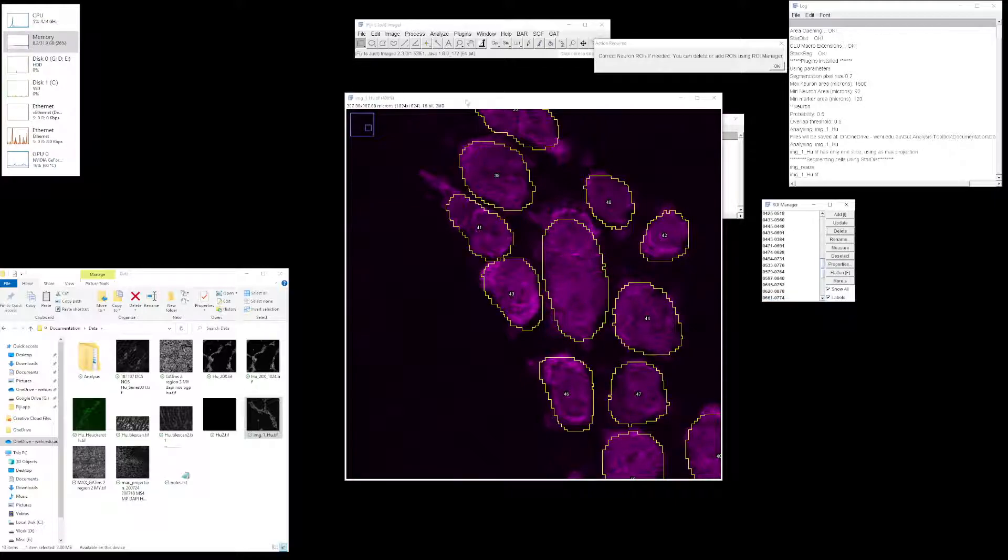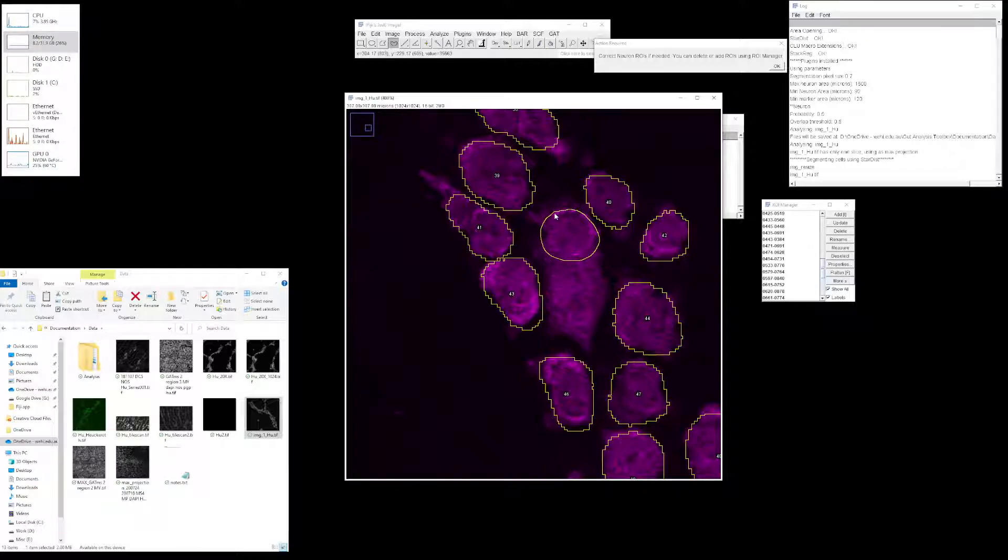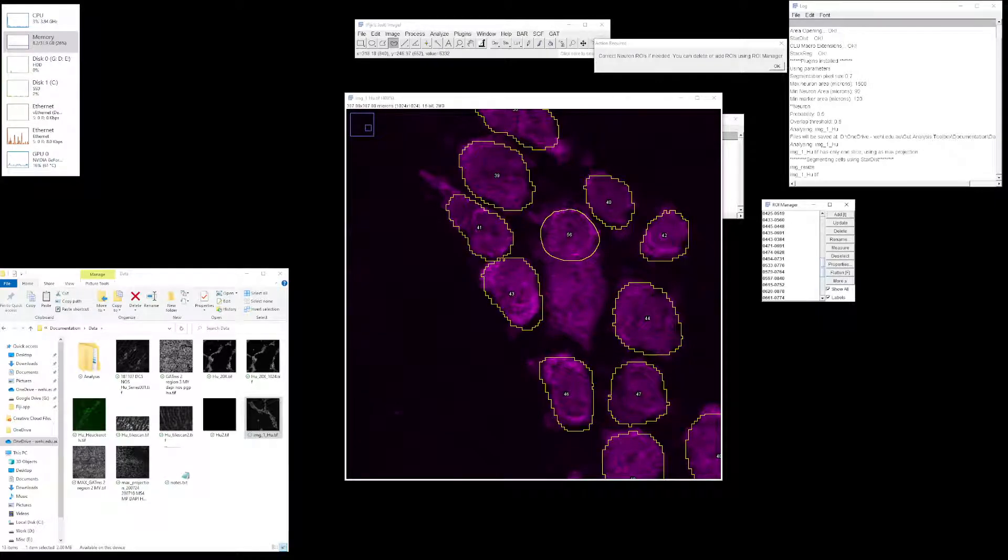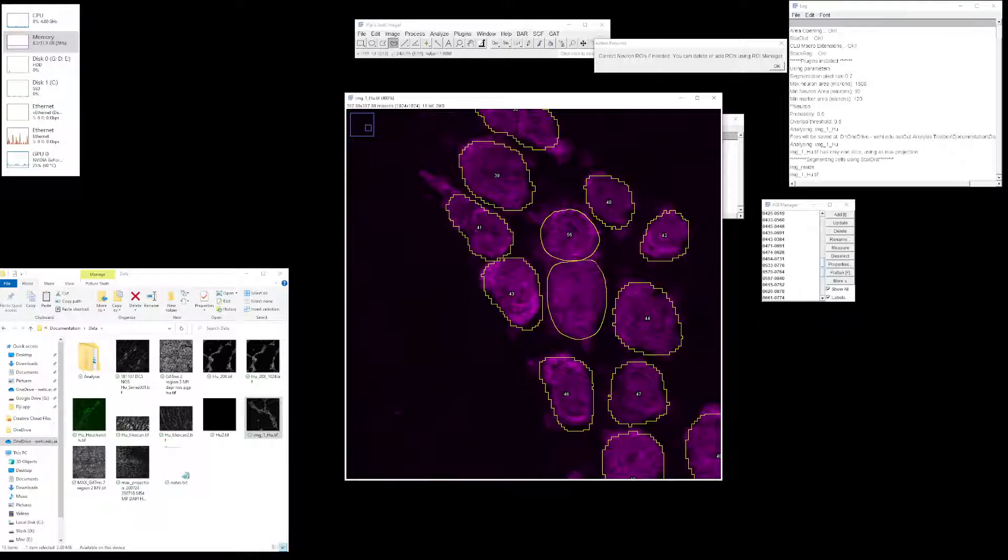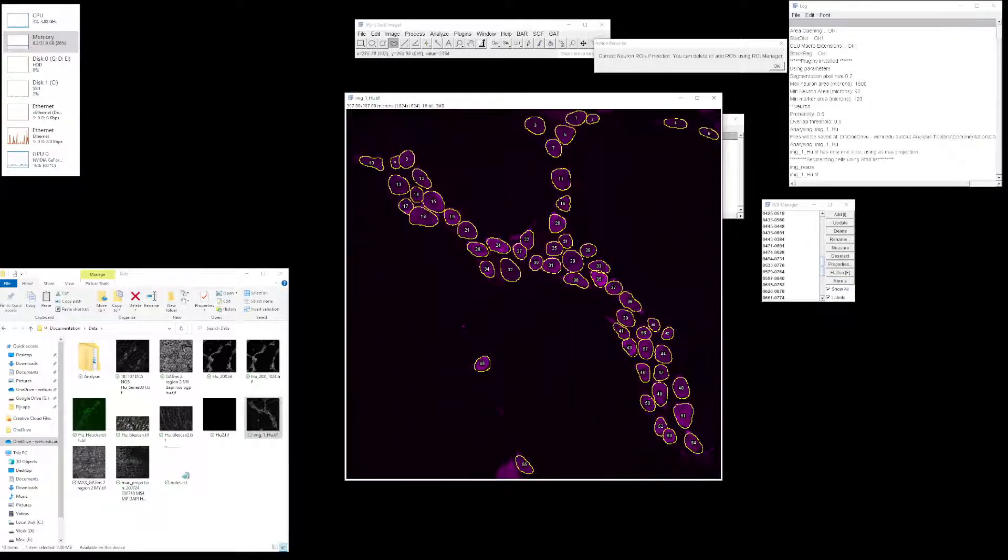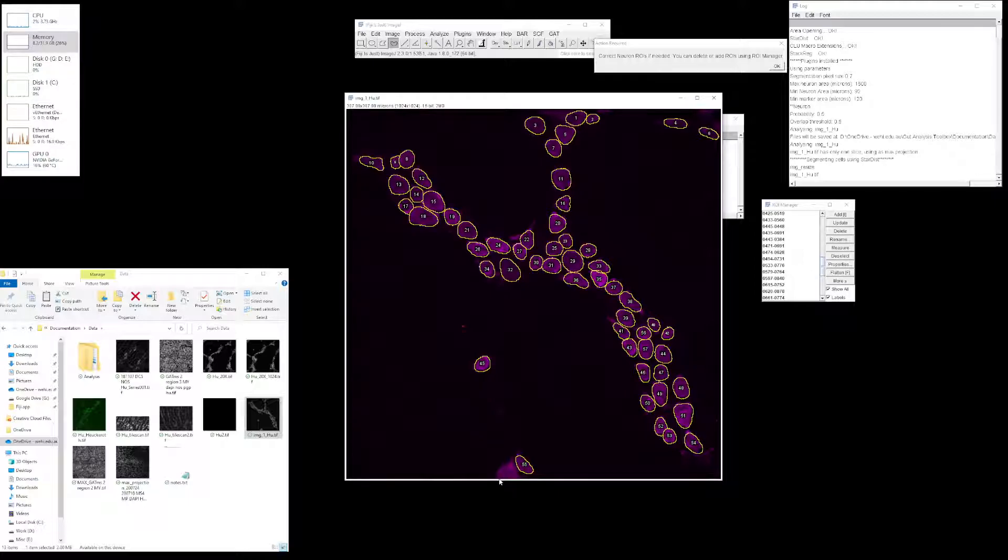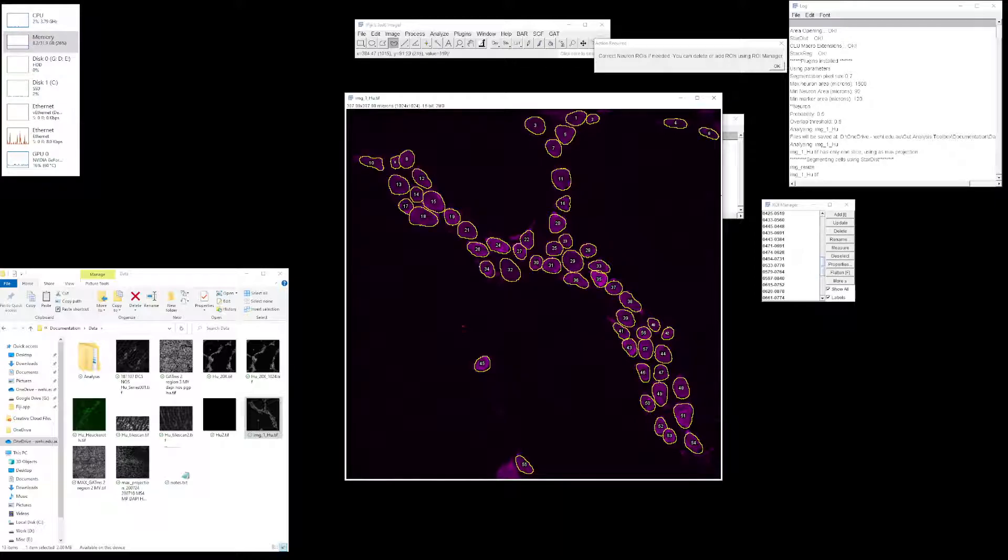You can also use the keyboard delete button. Click the freehand tool and draw an ROI. Once done, press add or use the shortcut T on the keyboard. Similarly, I draw another one and add it. Once you're happy with this analysis, click OK. If the neuron is clipped and touches the edge of the image, it won't be included. Otherwise, you're not getting the whole neuron, and this is the case throughout the analysis.